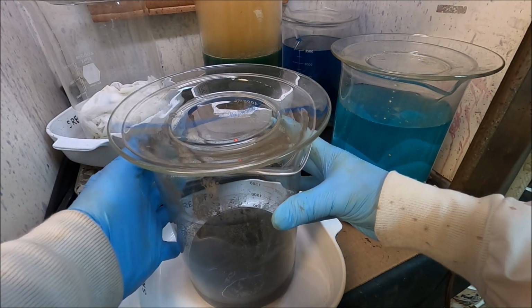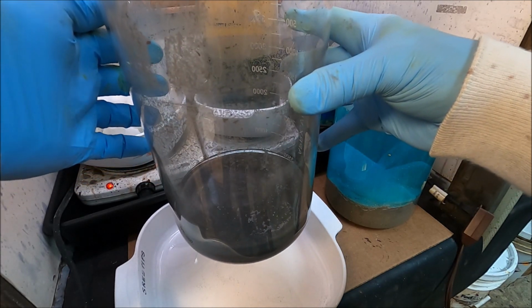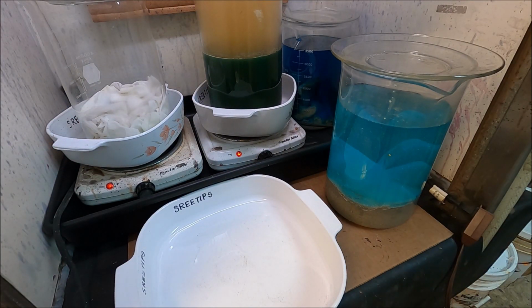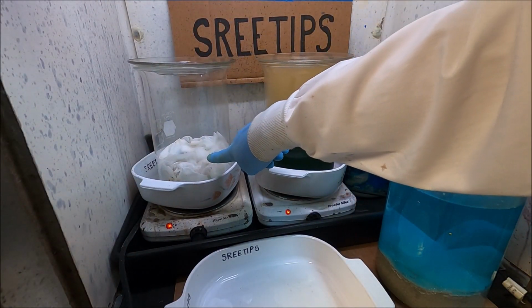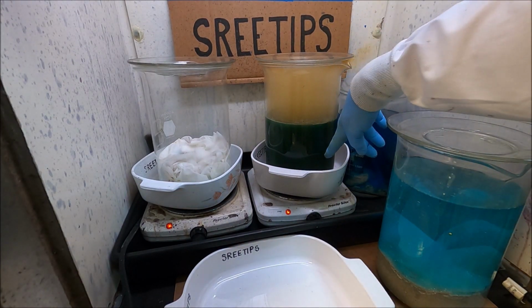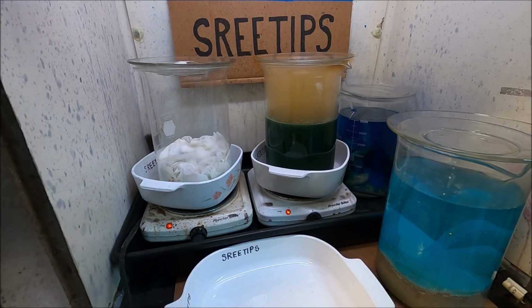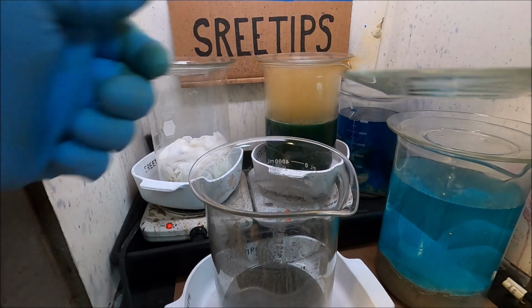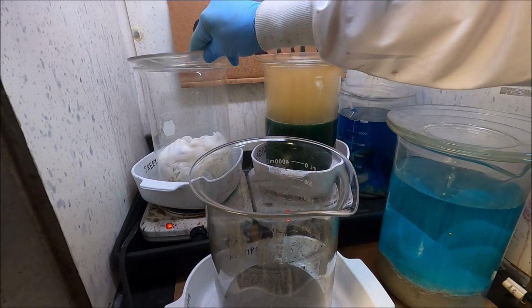Where we're at, I've got our solids here that we rinsed off of the slimes when we tried to rinse everything off the pieces of silver. I'm going to set this aside. I've got these two beakers back here. I've emptied all the acid and water into this one to try to get this to dissolve. I've poured some distilled water in here to rinse these filters off. Now, these are the solids that we strained off through that strainer earlier in the video in part 1. I'm going to add this rinse water to this beaker now.